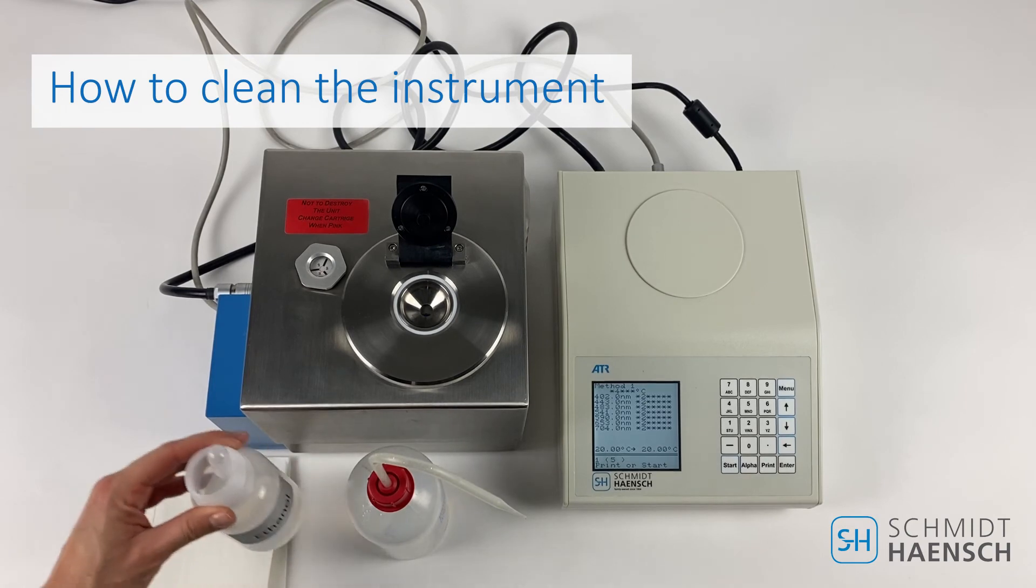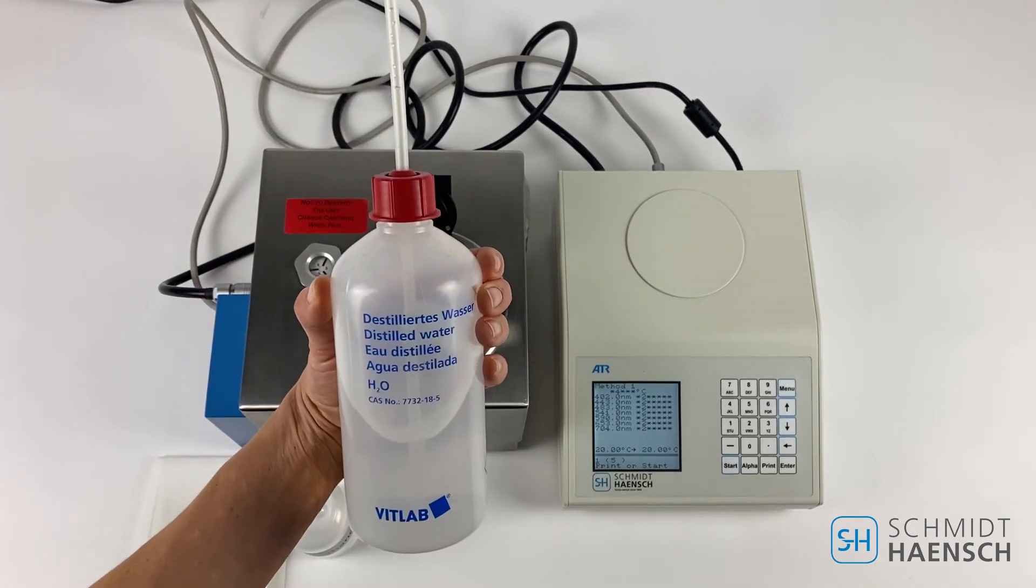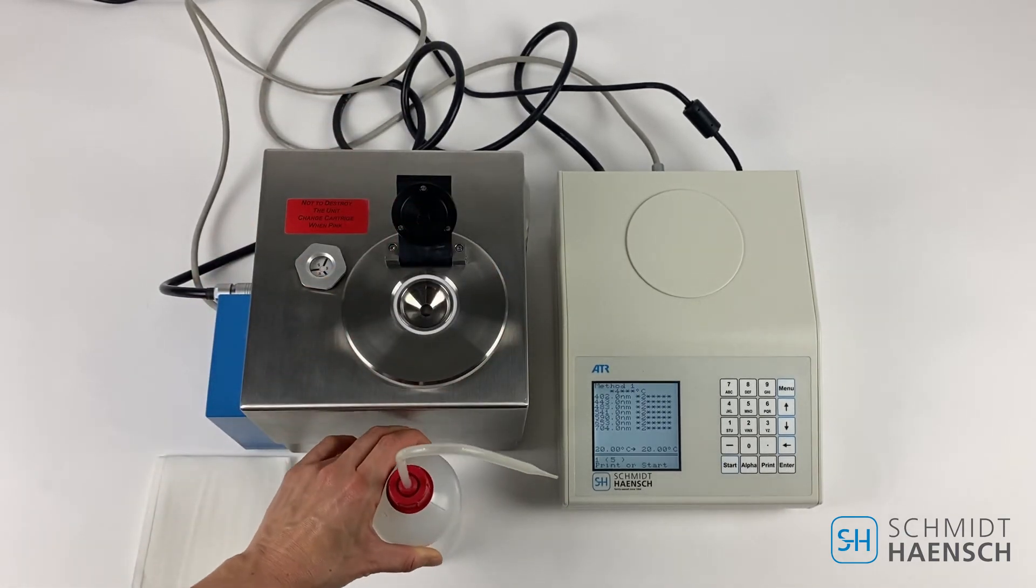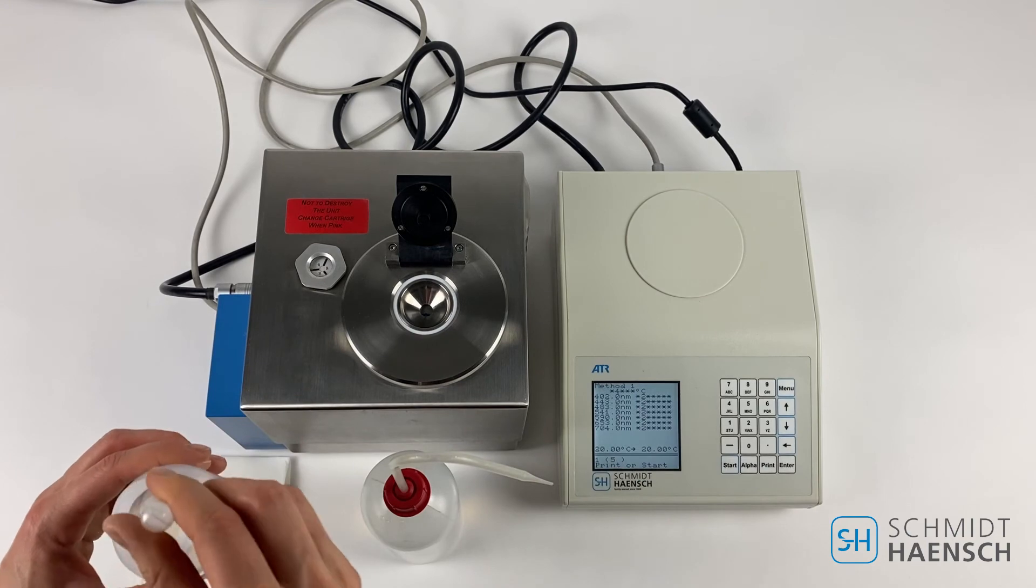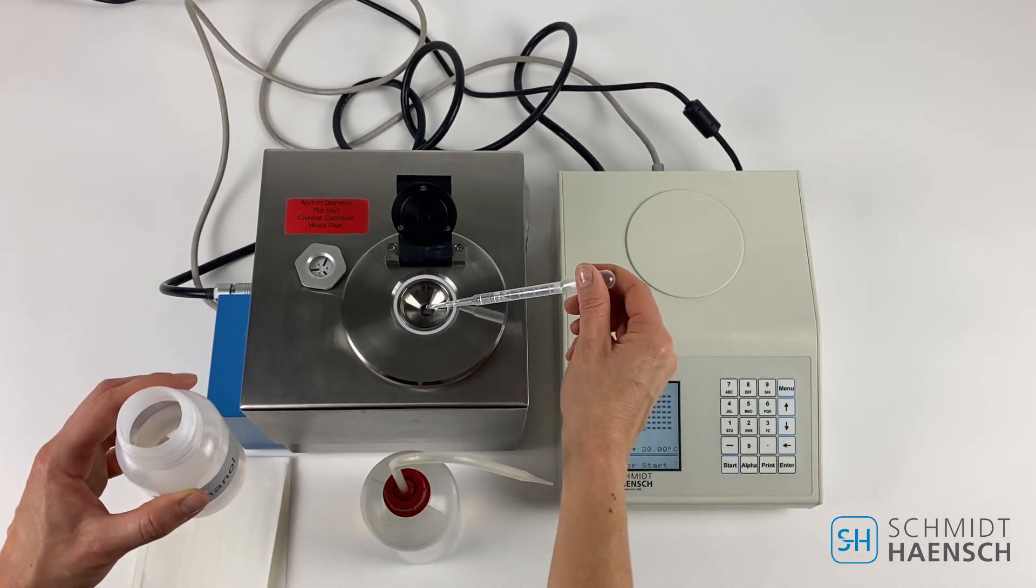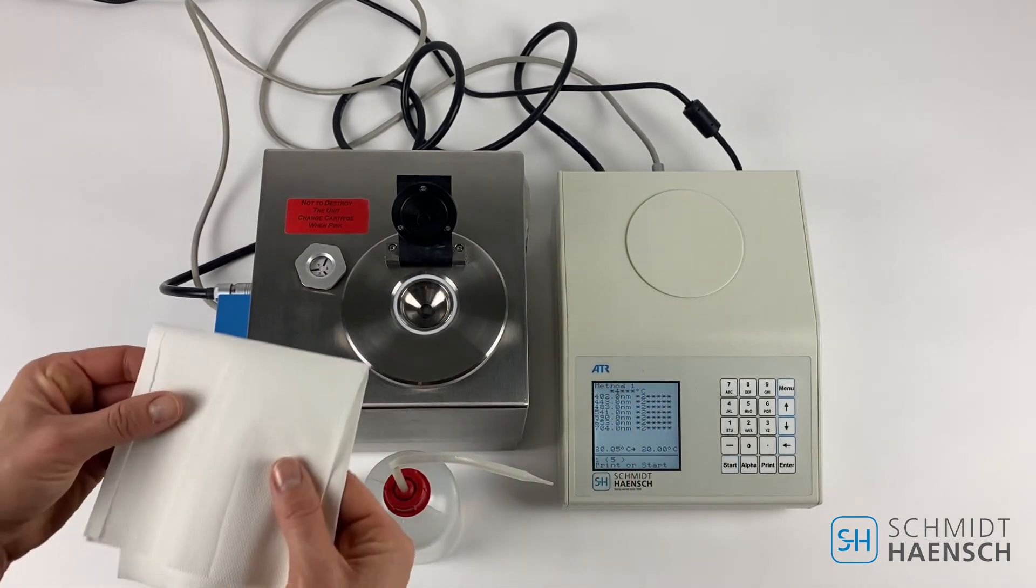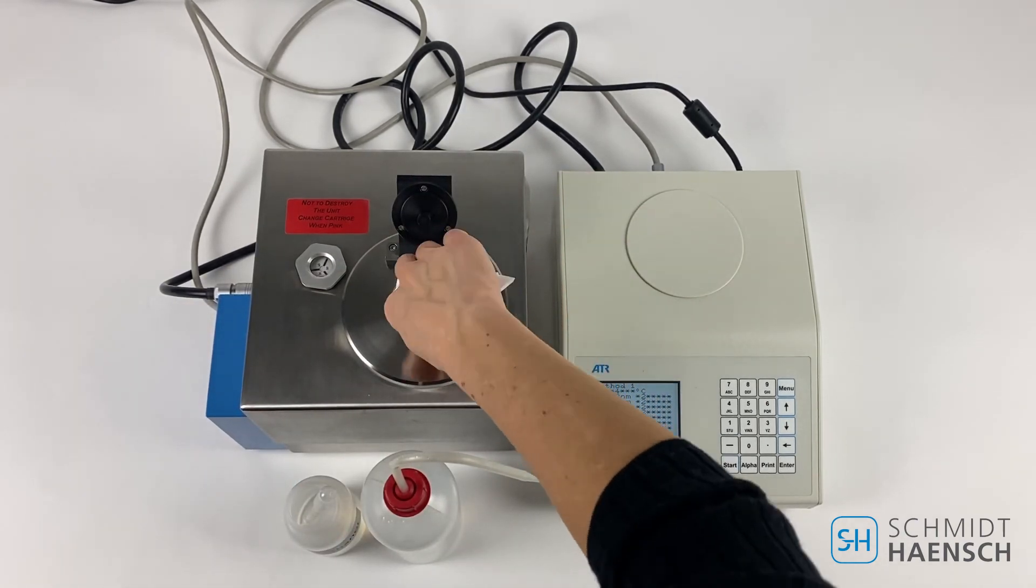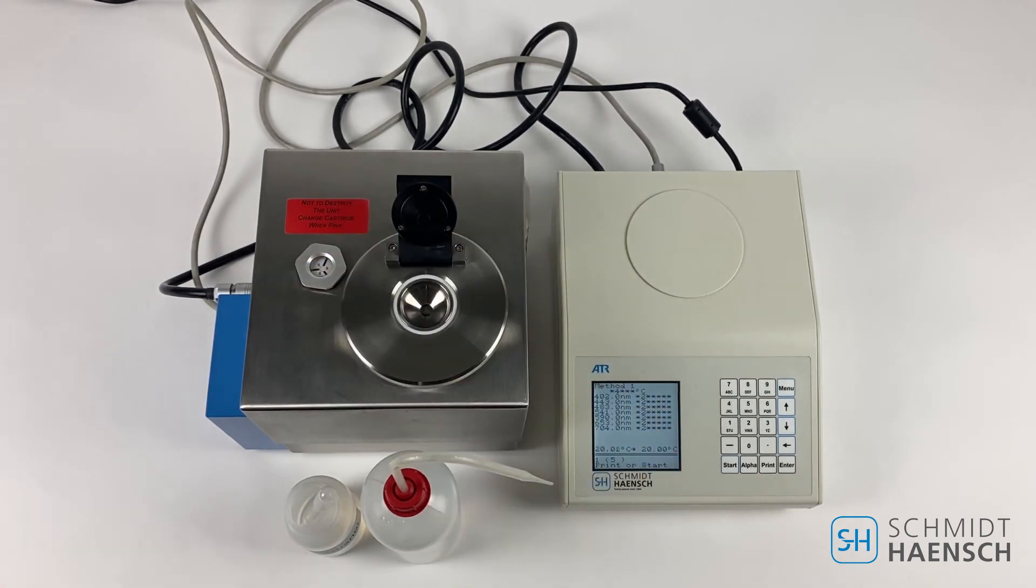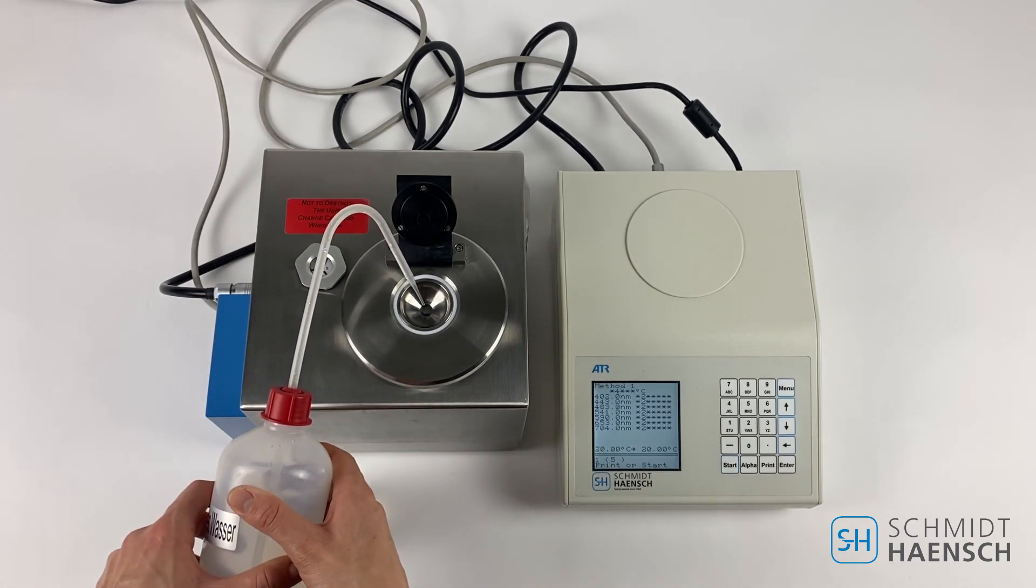Next we will show you how to clean the instrument. In between each measurement make sure you're cleaning the instrument with distilled water and ethanol first. Clean the surface with a drop of ethanol, take a clean wipe, and remove the ethanol. To ensure we have cleaned the surface correctly you can measure a drop of distilled water on top of the prism surface.